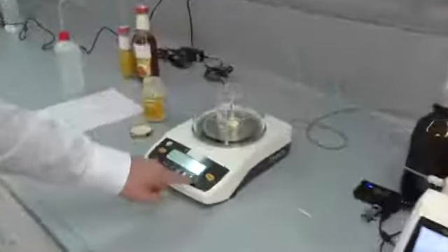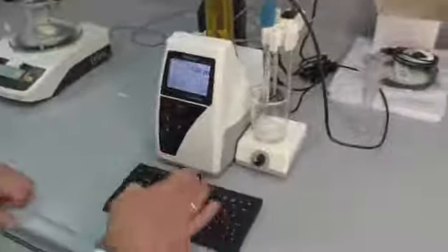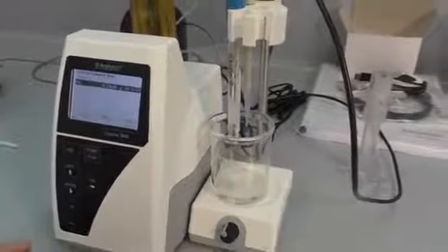That's the sample weight. If you press the print button, you hear a beep. When you're using an external keyboard and press F5, you can see the sample weight. This weight was automatically transferred to the TitroLine 5000.